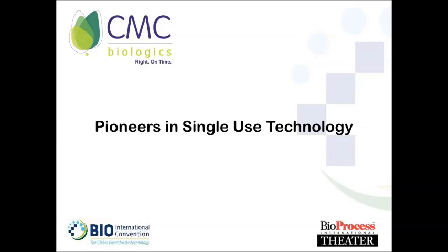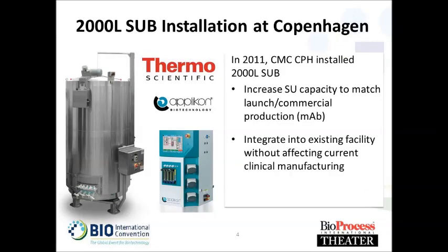So before I get into the main part of the talk, which is around the 6-pack that we installed in Seattle, let's give a little bit of background on our use of single-use technology within the company. We feel like we've been pioneers in this segment, and we feel like we've been on the forefront of technology and innovation, especially with single-use technologies, ever since the inception of the company. Back in 2011, we had a challenge that we needed to increase some of the capacity, where we had a 500-liter single-use bioreactor. So in order to match the customer needs, we decided to move into a 2,000-liter single-use bioreactor.